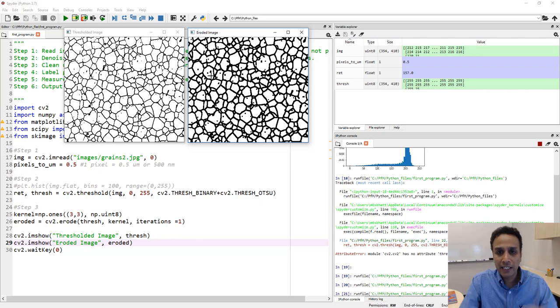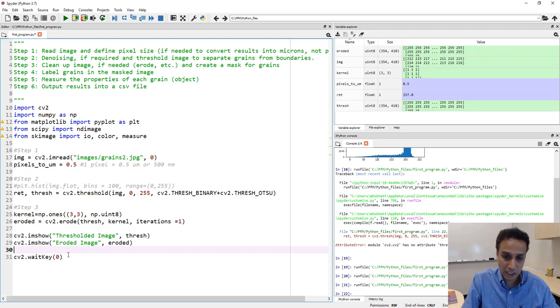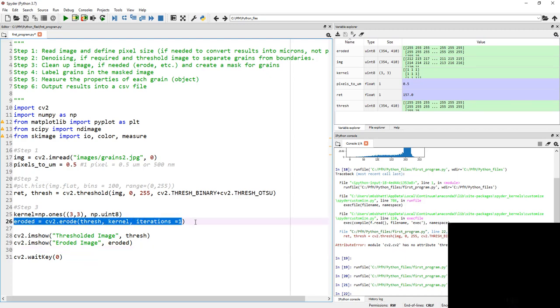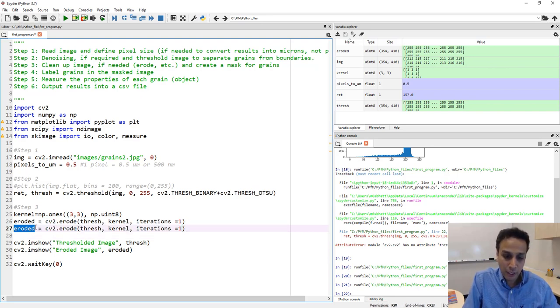All I did is take pixels down. I could have started with dilate to actually fill some of these. There is an operation called hole fill. There are a few things that you can try, but I don't want to experiment with that right now. But I eroded this. Now let's go ahead and dilate it so we are not changing anything here. So we go back without changing the image by a lot. Now I want to dilate this, and the operation is cv2.dilate, and we are going to dilate the eroded image. So my input image is eroded. So let's actually look at the dilated image now.